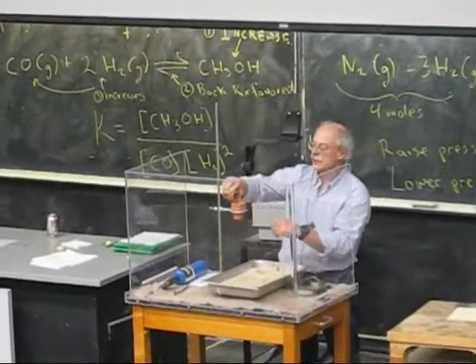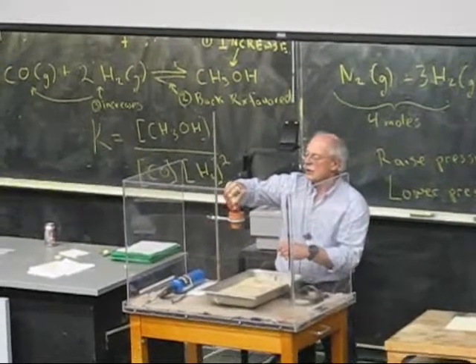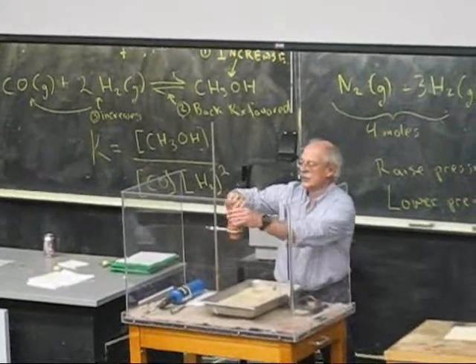And you always want to take it out of the glass vessel first. So here we go. I'm pointing this. I'll stand.